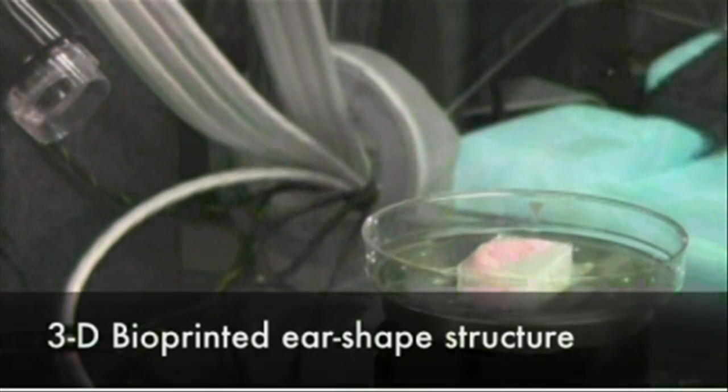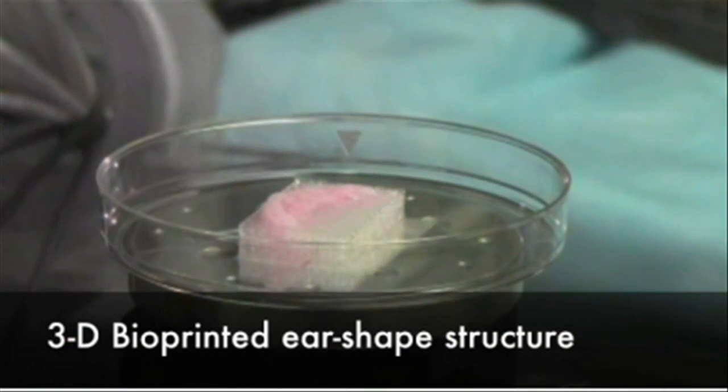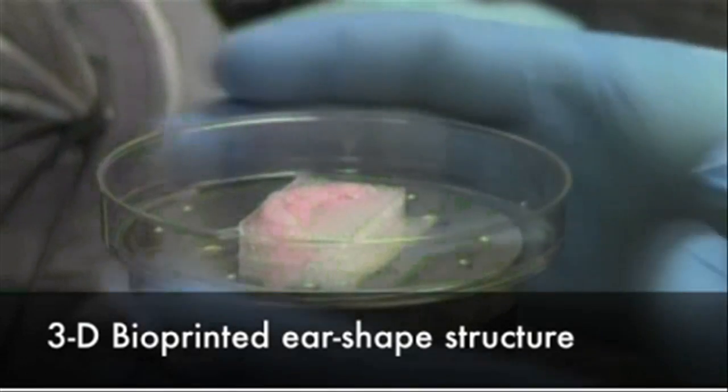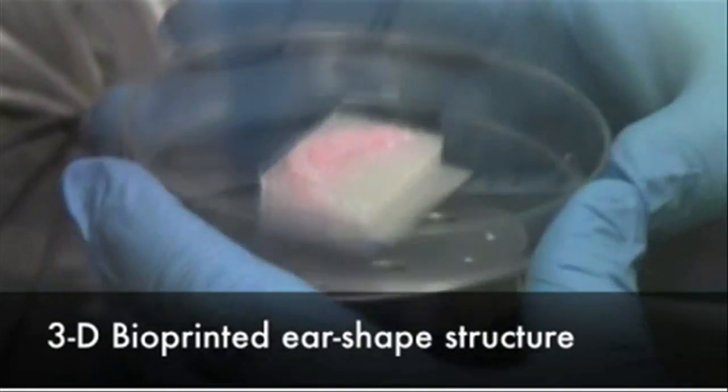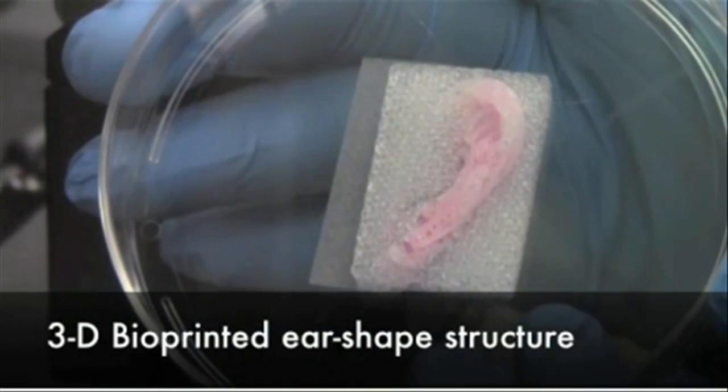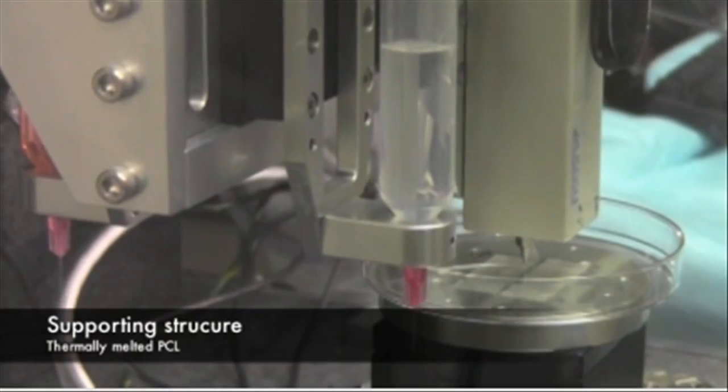Another advantage of the ITOP system is its ability to use data from CT and MRI scans to tailor-make tissue for patients. For a patient missing an ear, for example, the system could print a matching structure.